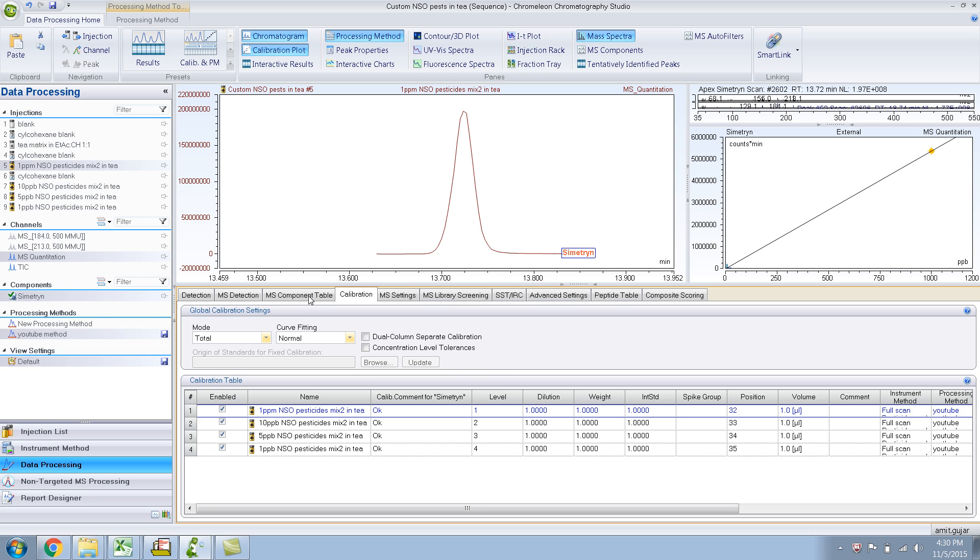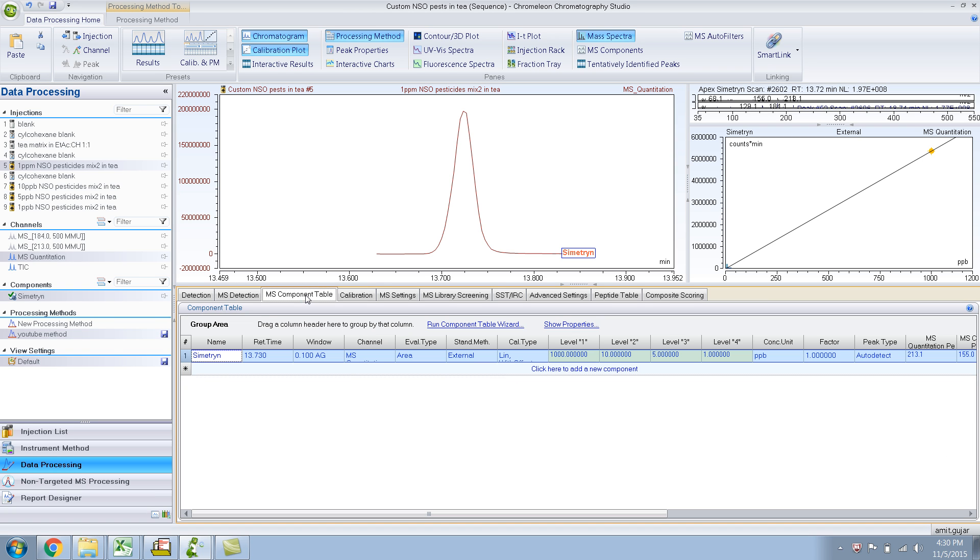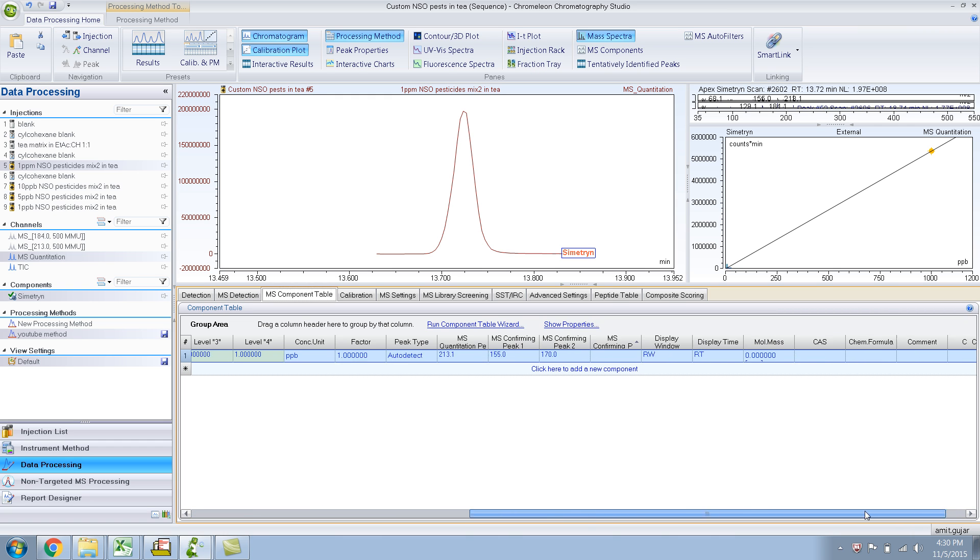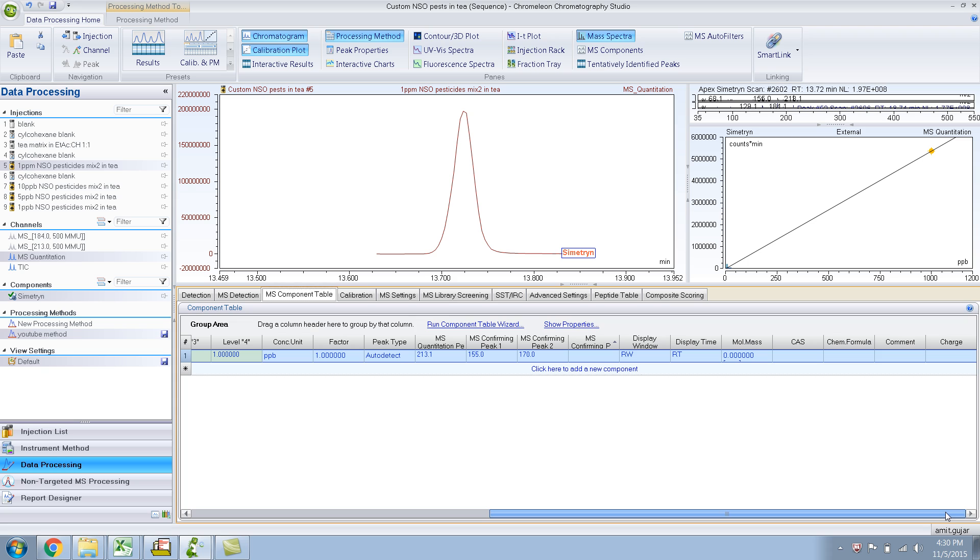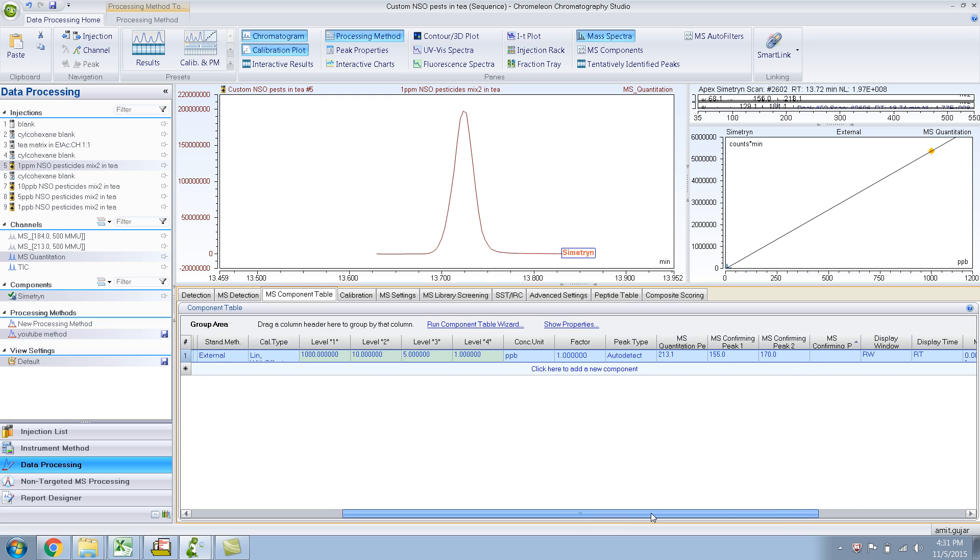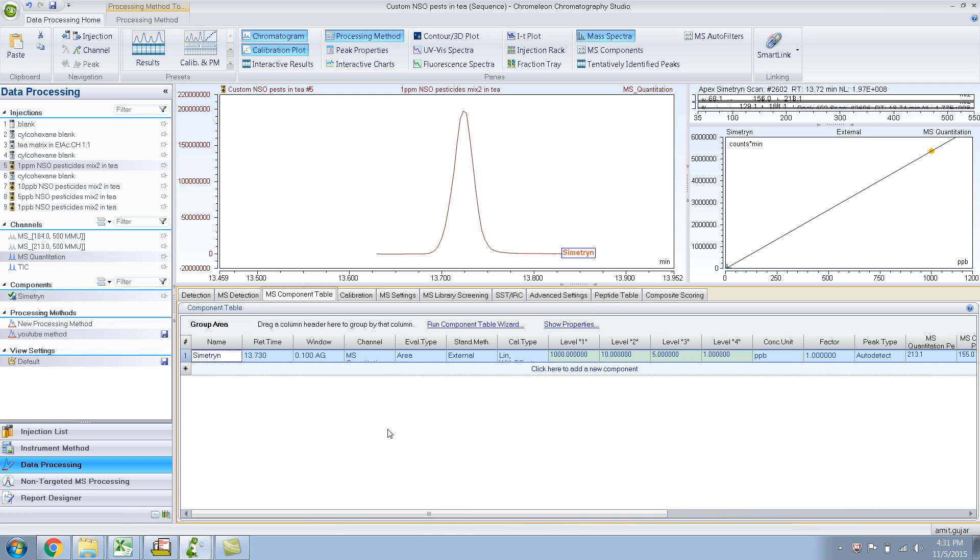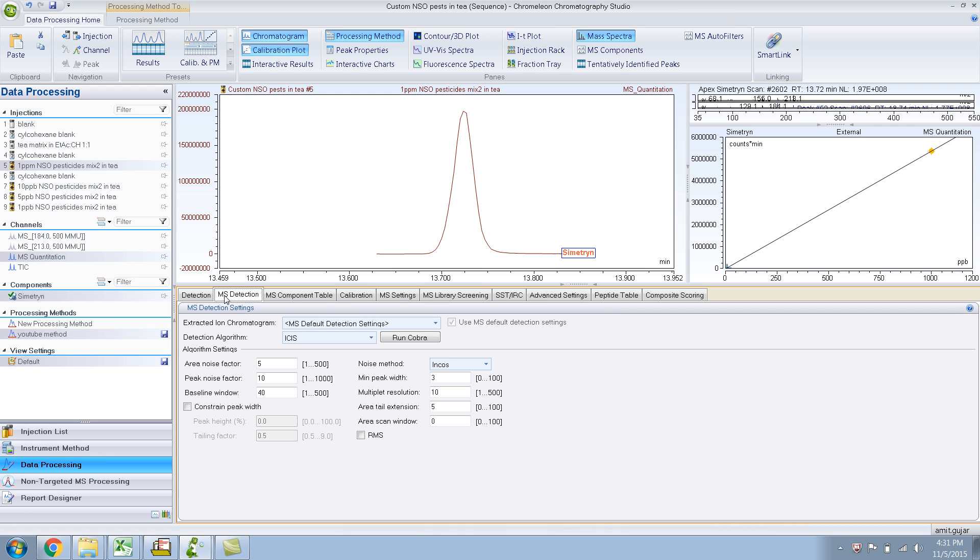I already went over the MS Component table. If you want, you could add in the CAS number, chemical formula, or any comments that you like. MS Detection. Like I said, here we use what detection algorithm you want for your peak detection and peak integration.